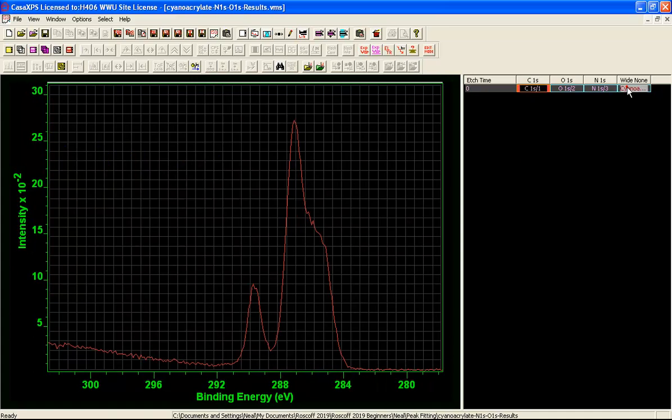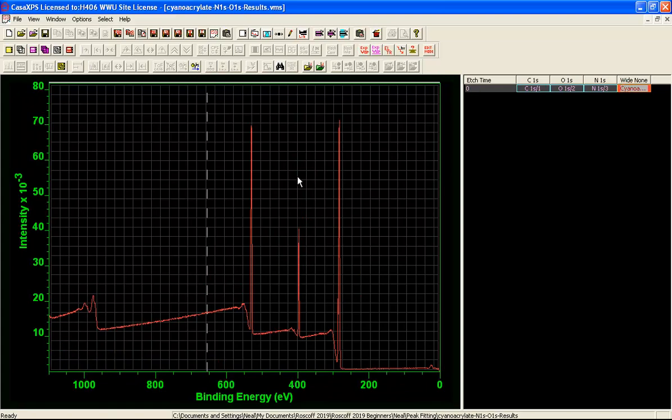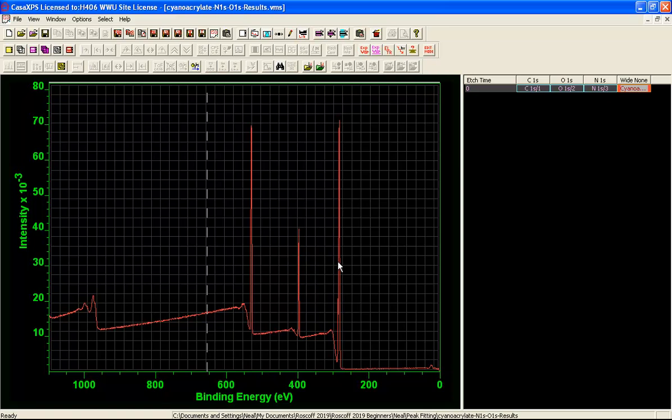However it is worth confirming that this is indeed the case by looking at a survey measurement and seeing the proportions of these different peaks in terms of the survey data so we have got oxygen, nitrogen and carbon and these should be in the ratio of 2 to 1 to 6.